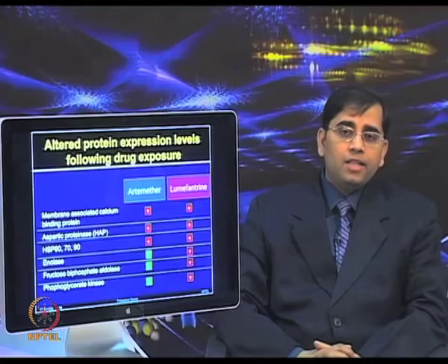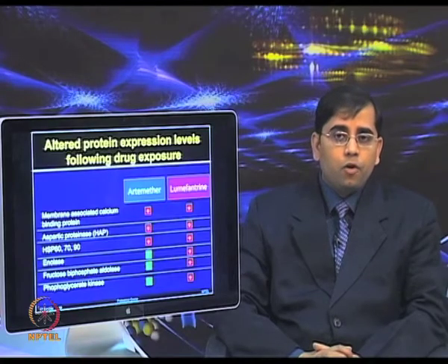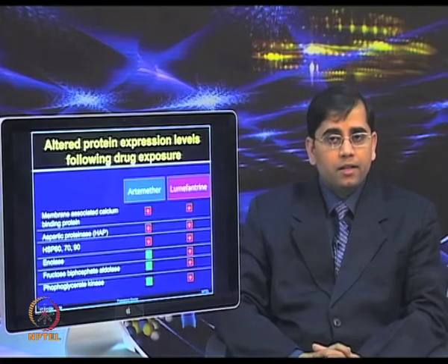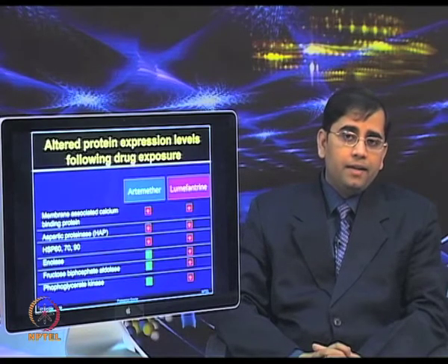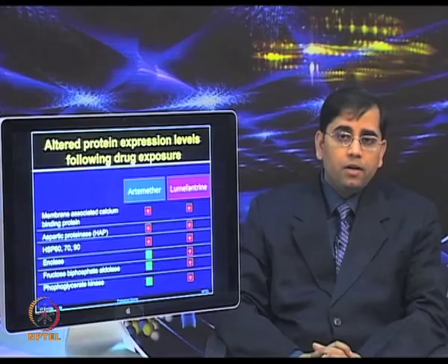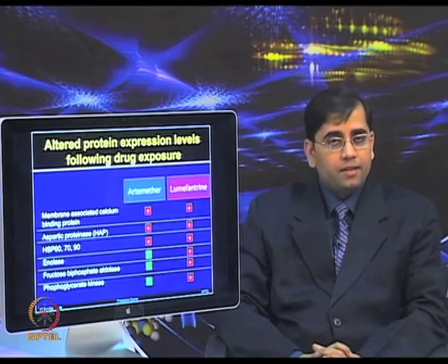The comparative analysis of 2D gels from untreated and drug treated parasite protein fractions provided direct and distinct alterations in the parasite proteome following artemether or lumefantrine treatment.